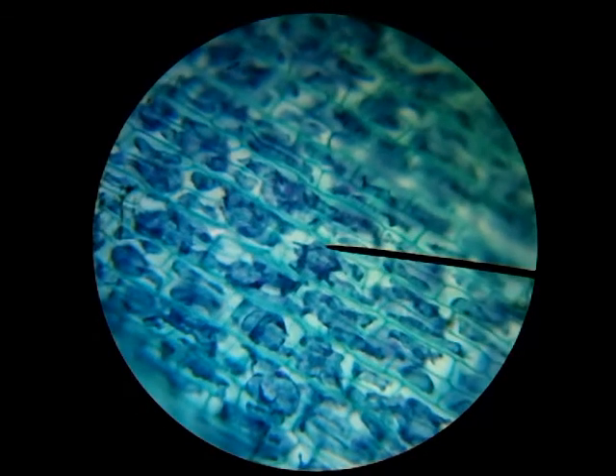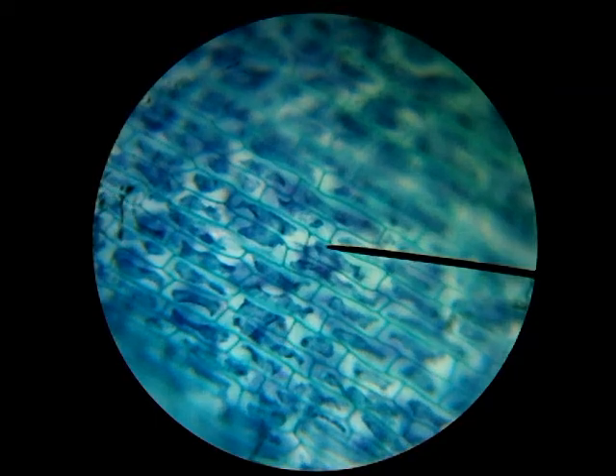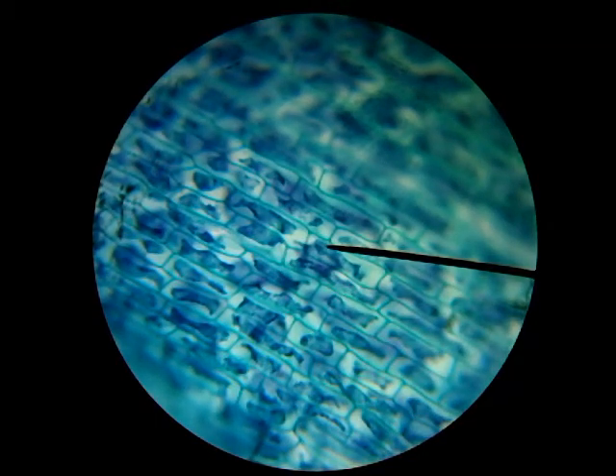To zoom in and out we're just changing the distance between the stage and the lens using the fine focus knob. Here we can see those really distinct cell walls that define this as a plant cell — they all fit together neatly and perfectly, and that's what makes them a plant cell.